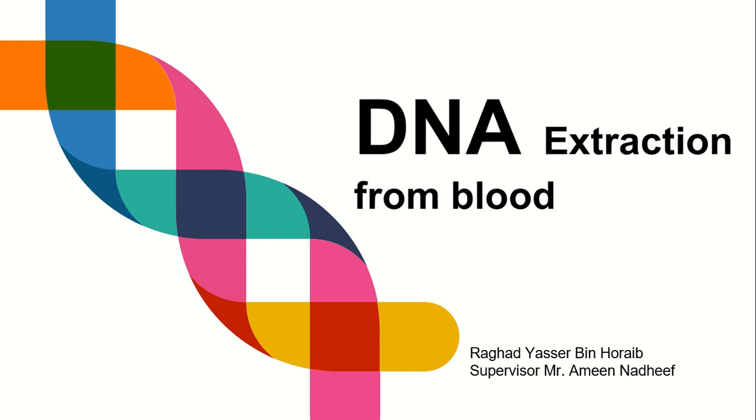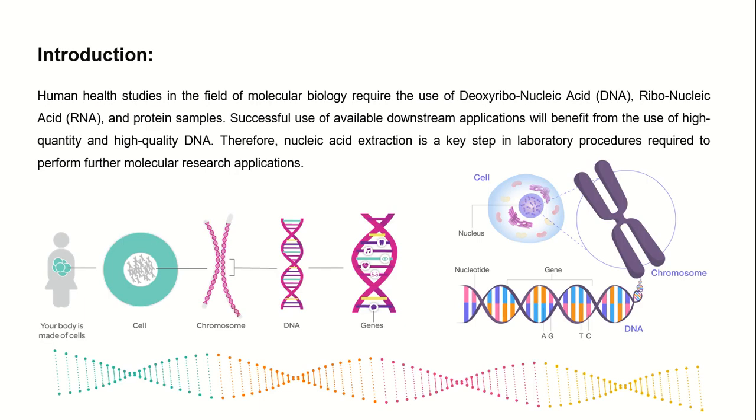My topic today is DNA extraction from blood. Human health studies in the field of molecular biology require the use of deoxyribonucleic acid (DNA), ribonucleic acid (RNA), and protein samples. Successful use of available downstream applications will benefit from the use of high quantity and high quality DNA. Therefore, nucleic acid extraction is a key step in laboratory procedure required to perform further molecular research applications.